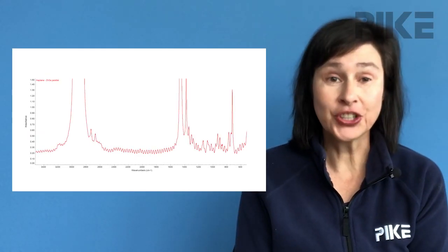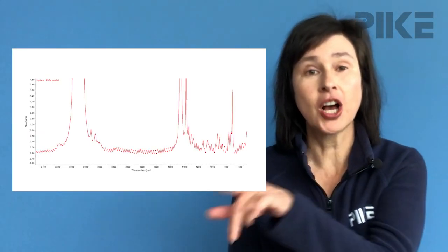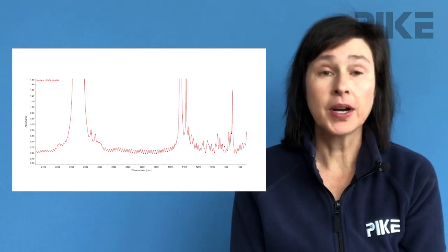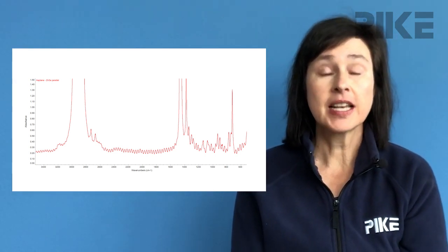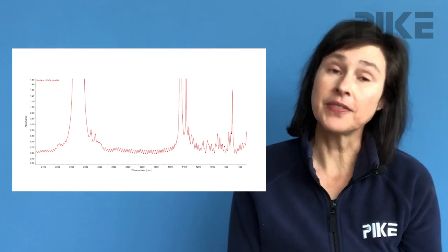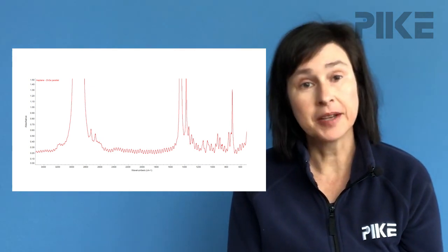One of the first things you'll notice is this fringing pattern all along the baseline, and this is common for transmission cells with a window that has a higher refractive index, such as zinc selenide or germanium, because the beam will come through and ricochet between the two parallel surfaces of the windows.